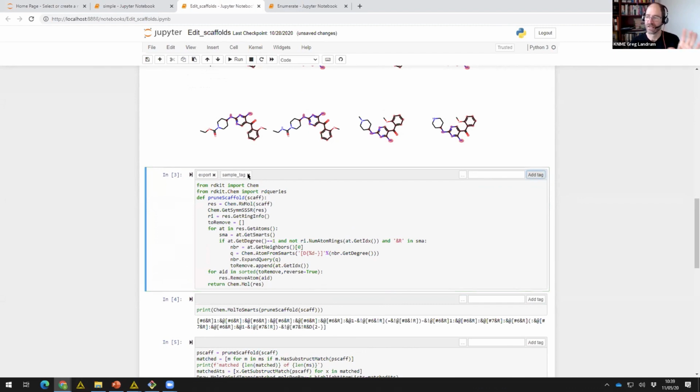This is a trick that I use continuously when I'm using Jupyter together with KNIME. I have lots of testing code so I can see that my notebook is actually doing what I want it to do. And then the functions and classes that I want access to in KNIME, I just make sure that they're nicely self-contained in cells, and then tag those cells export.